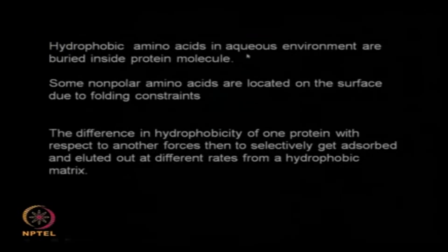So generally, as I said, in an aqueous environment these are buried inside the protein, but sometimes non-polar amino acids are located outside due to the folding constraints. So if you have proteins of different hydrophobic surfaces, then you can separate out using this hydrophobic interaction chromatography.